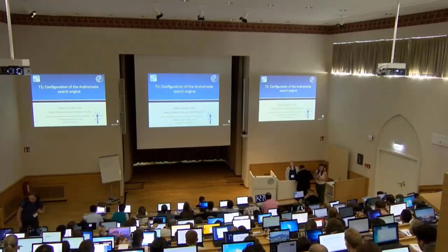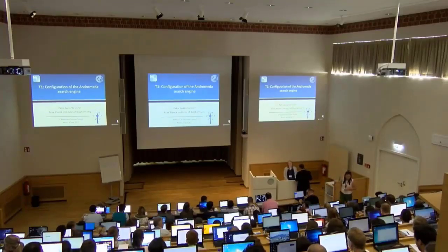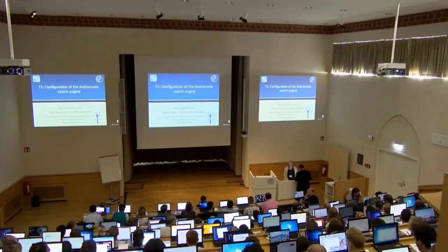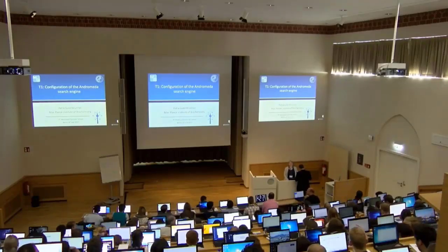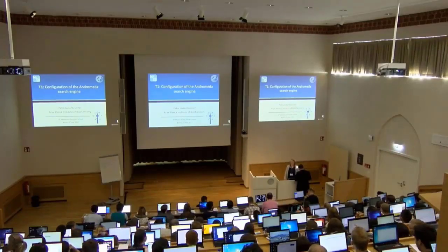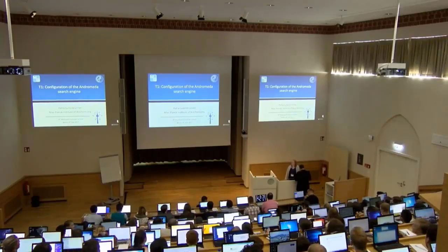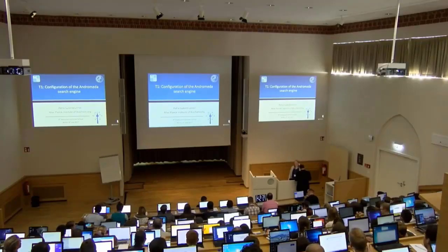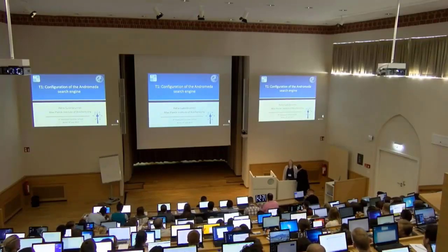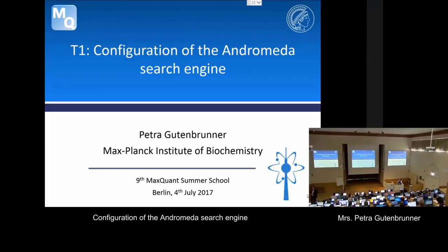So, welcome everyone. Can you hear me? I think everyone can hear me, right? I hope you all had a good lunchtime and we can start fully energized now with the first tutorial session, which will be about the configuration of the Andromeda search engine. We have already heard a lot about modifications, and we will learn now how to configure new things.